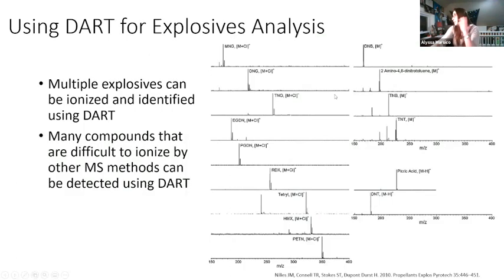Again, we can use it with explosives analysis. And again, it's a good thing to have for hazardous substances, because you don't want to be exposed for too long to these hazardous substances or things that can go boom if you're not careful.